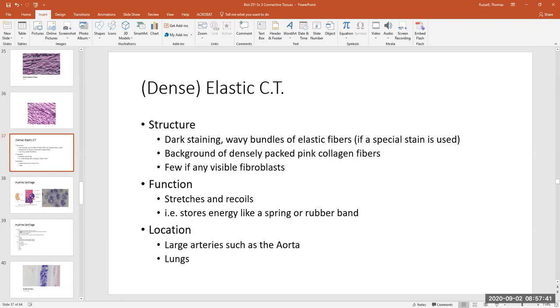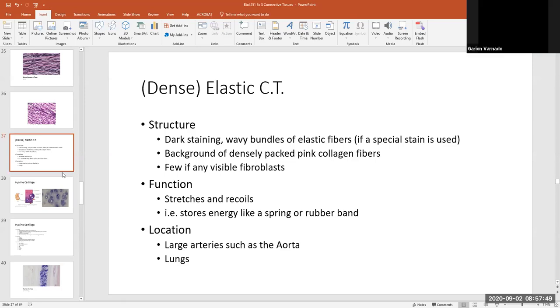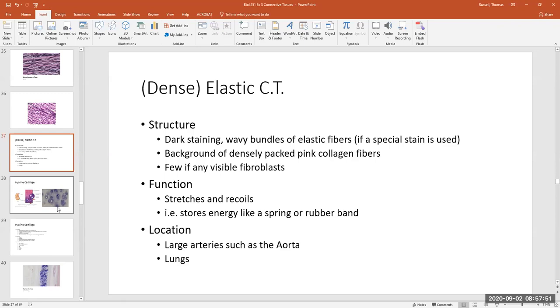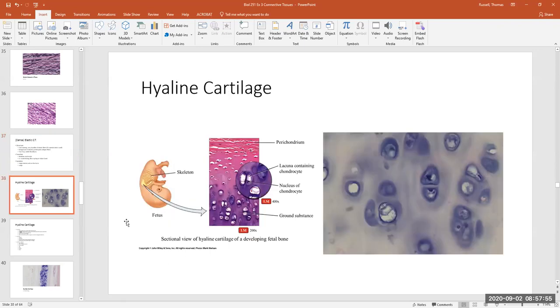Before we leave the dense connective tissues, let's get into some of the special connective tissues — the cartilages. There are three types of cartilages. The first is a very widely distributed cartilage in the body called hyaline cartilage.